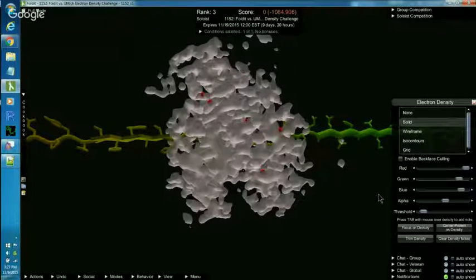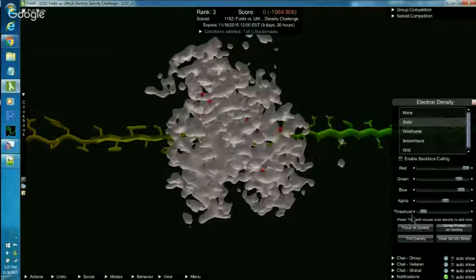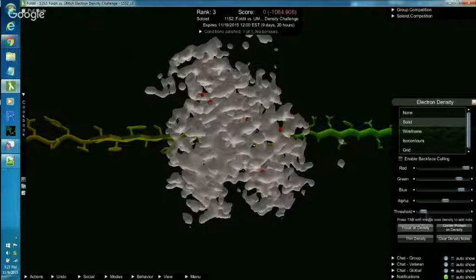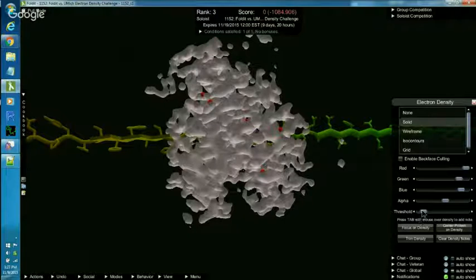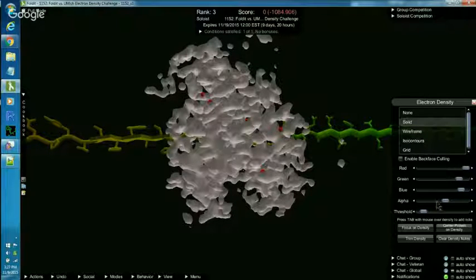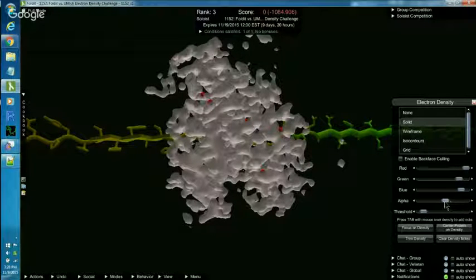Just a quick review of the Electron Density menu settings. I've got my threshold set right above the M in the word mouse and I've got my alpha, which is transparency, set a little bit to the right of center.